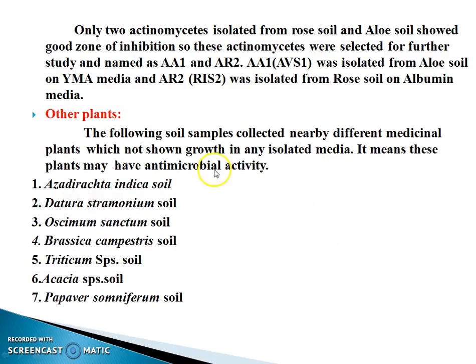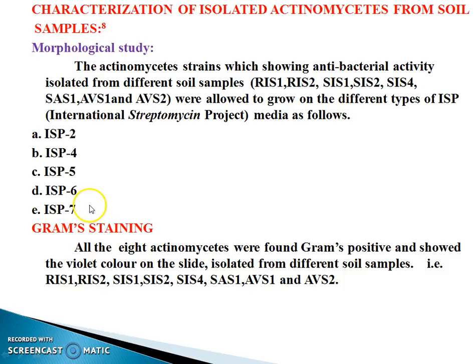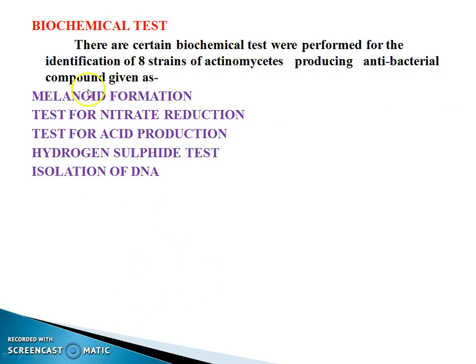And these are the plants I selected, from near whose area the soil was collected. And then Gram staining of the microbes was performed, and these are the results.